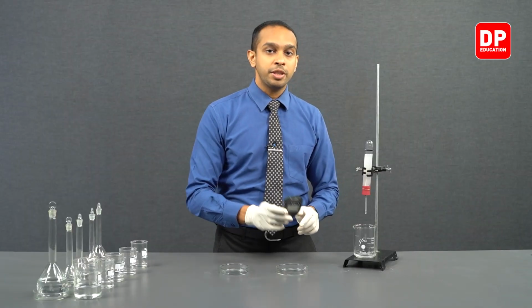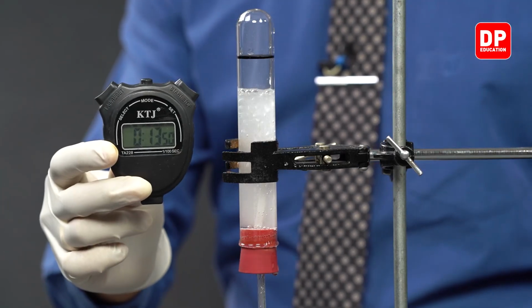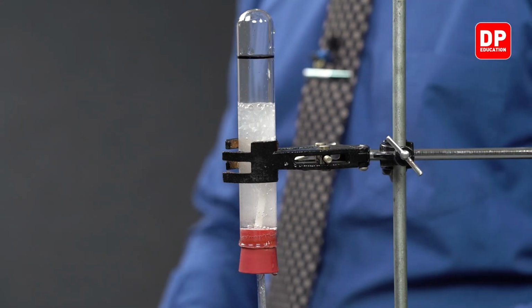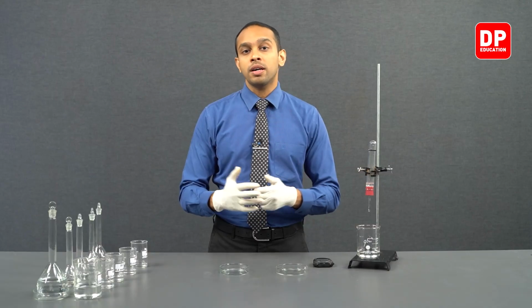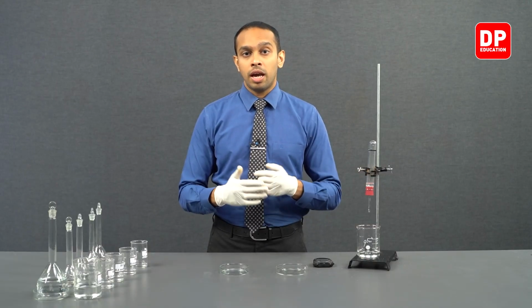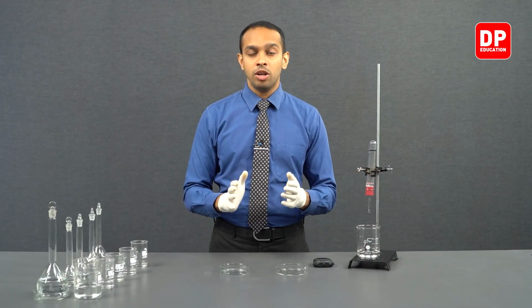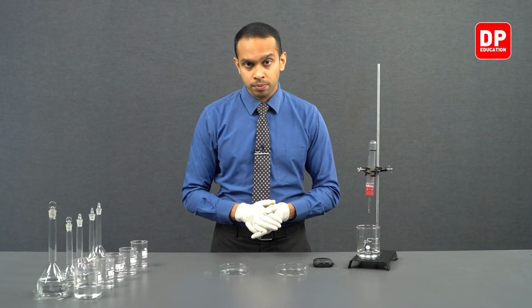Students, it took 13 seconds. It took 13 seconds for this reaction to take place. Now we saw how fast the reaction is proceeding every time we increase the HCl concentration. So we can very clearly observe that HCl concentration affects the rate of the reaction.